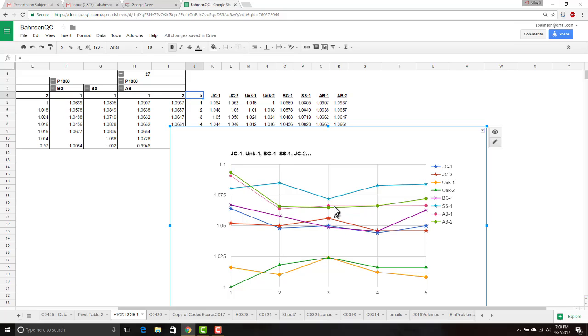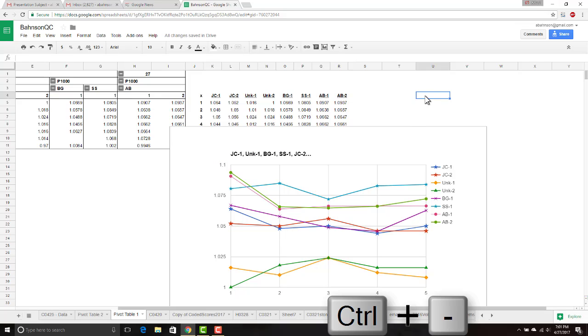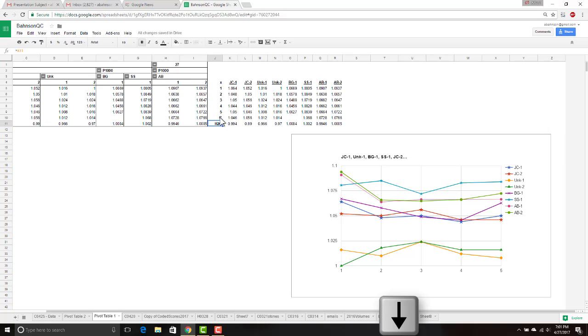The three people that did two replicate measurements of each sample seem to have precision that gave duplicates similarly far apart. There's better ways to say that, but the problem I want to bring up here is that this graph is not including the two samples called 5' and H2O. And it's because it's plotting these x values as numbers, the first, the second, and they're equally spaced the way integers are. And so there's a problem that we can fix here if this graph changes.